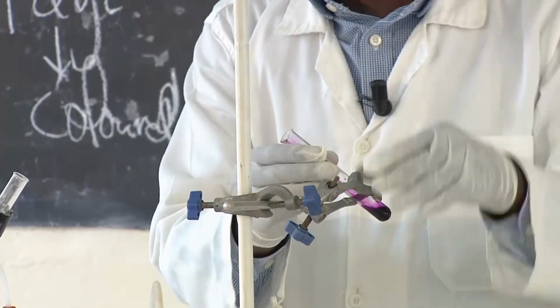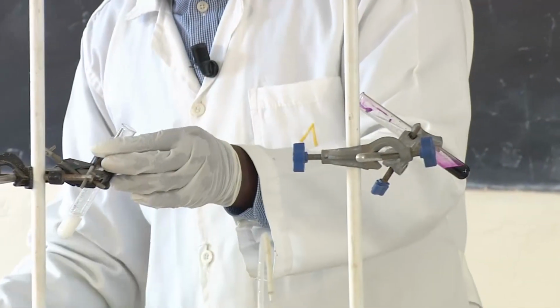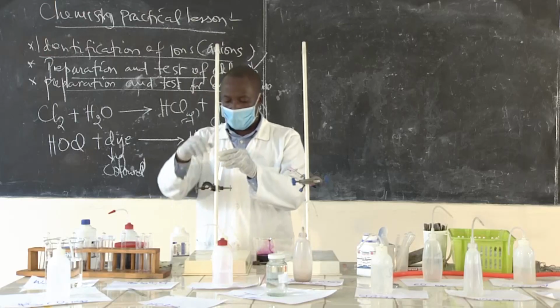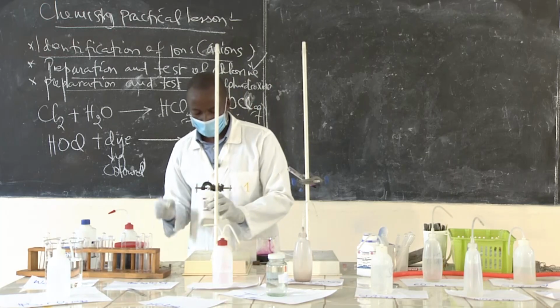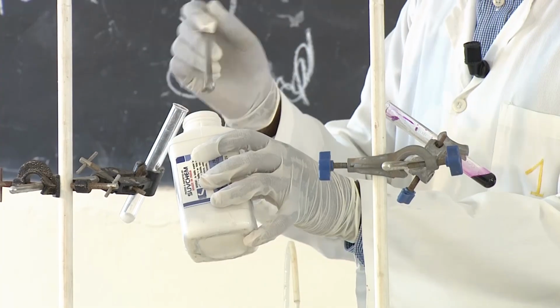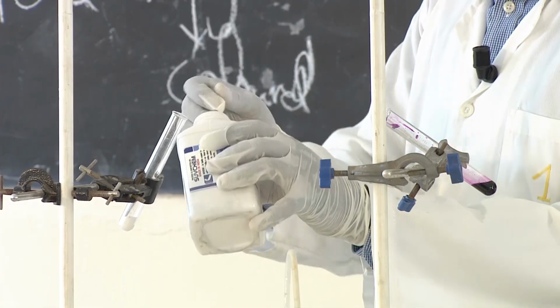Potassium permanganate solution. And then we pass the gas in there as well. So we have to prepare it once again, and then add the sulfite again, as we mentioned.